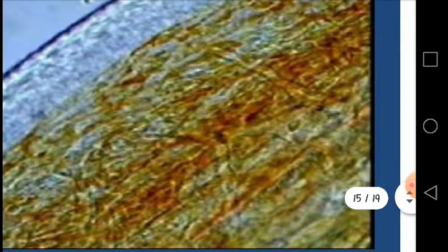You can also observe the circular cells, which are the red blood cells flowing in these capillaries. And these capillaries are one cell thick, so they are very helpful for the exchange of material between the tissues, cells and the blood. From this micrograph you can easily observe the flow of the blood in the capillaries of the fin of the fish.